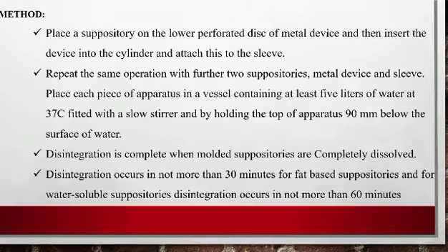Then we put the suppositories in water with a slow stirrer, and the water will be around 37 degrees Celsius. We have to hold the apparatus 90 millimeters below the surface of the water. Next, the disintegration is complete.